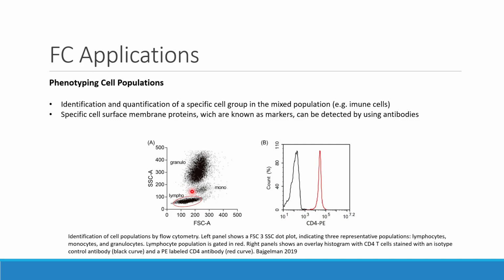Therefore, side scatter and forward scatter analysis allows for morphological discrimination and quantification between lymphocytes, monocytes, and granulocytes, but does not allow the differentiation of cellular subtypes such as CD4 or CD8 T cell subtypes. This kind of profiling to distinguish morphologically similar subtypes can be made by using fluorescent markers as antibodies, which will characterize the presence of specific targets that identify cells.